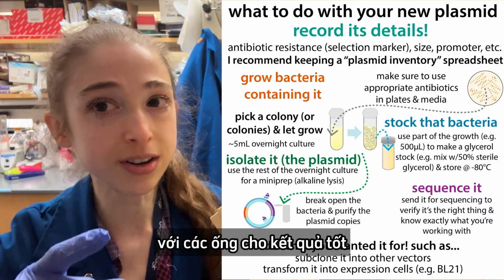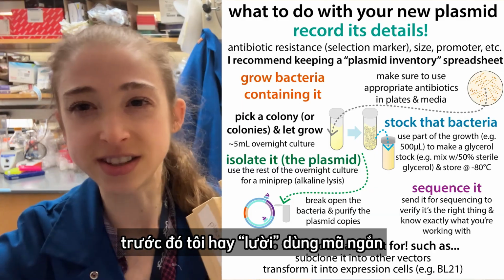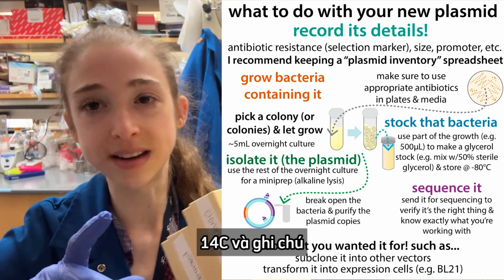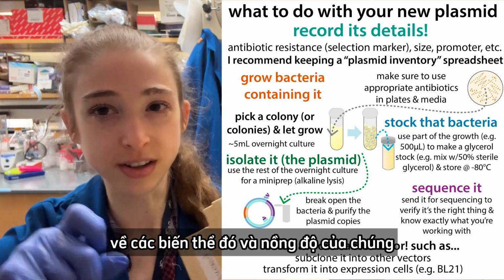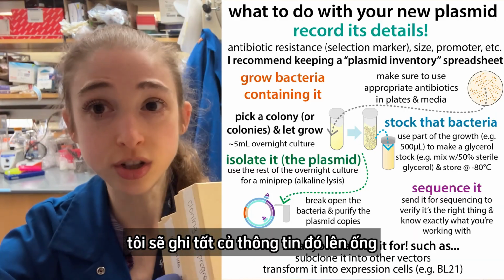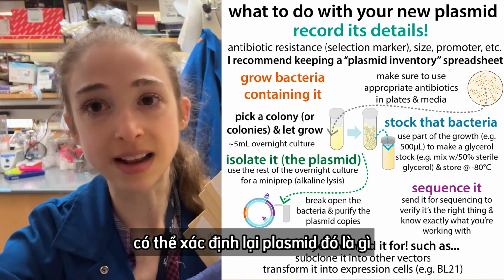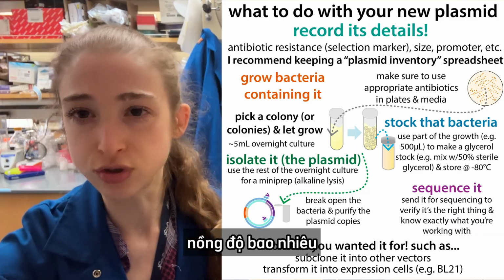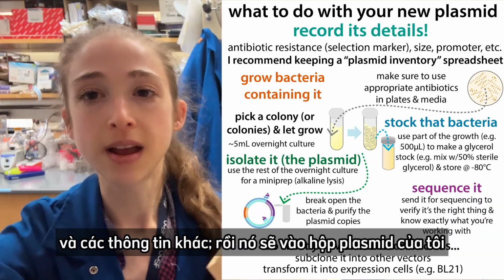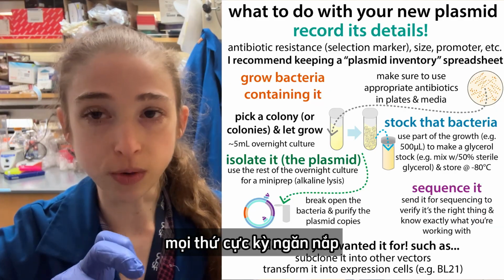Now for the tubes that were good, I'm going to put some more detailed information on the tubes. I kind of am lazy earlier on and just use little short codes like 14A, 14B, 14C, and then have notes on what those various things are and their concentrations. Once I've verified them, I write all that information on the tube so that the person in the future, me or someone else, is able to identify what that plasmid is, what the concentration is, all of this various stuff. And it'll go into my plasmids box, organized by their construct number and things like this. So everything is super duper organized.